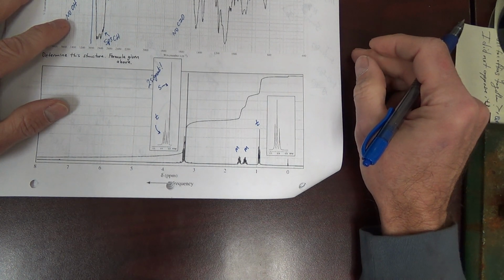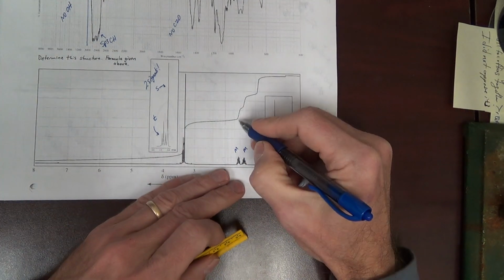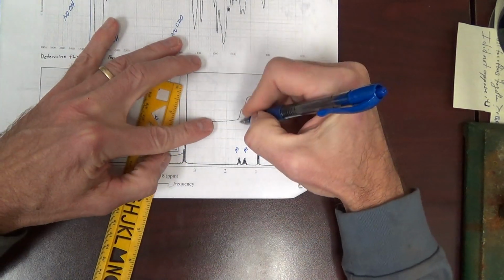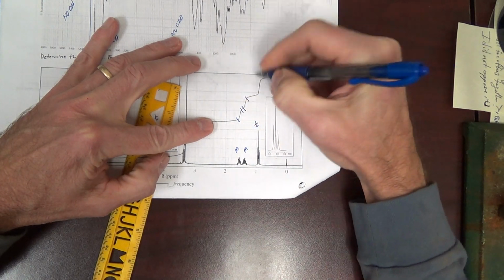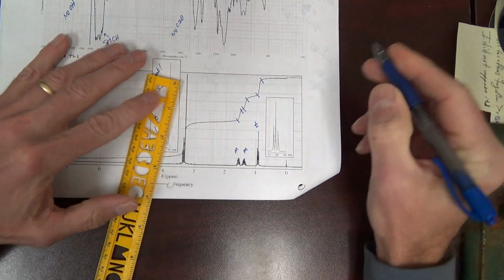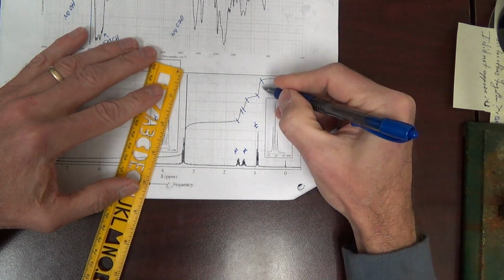Integration. Let's maybe look here. Integrals. Boom, boom, boom, boom, boom, boom. These two look the same. This looks a little longer.